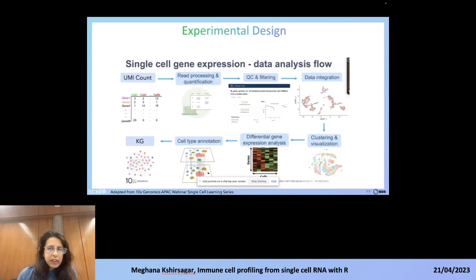After that, we'll do the visualization and see what labels each of the annotation tools are assigning to the cells, so how the cells get labels. Then we'll perform the differential gene expression analysis. When we perform this, we'll have feedback to the annotation tools, and based on that information they can reassign the cluster labels. Once we have the cluster labels from the annotation tools, we can build knowledge out of that, which would be done with the knowledge graph.